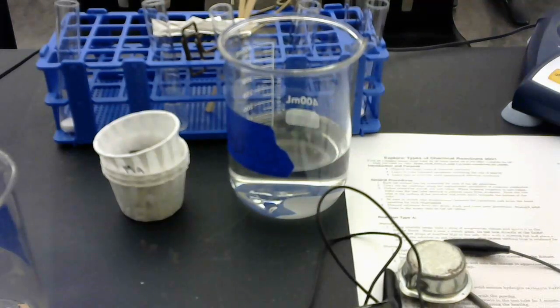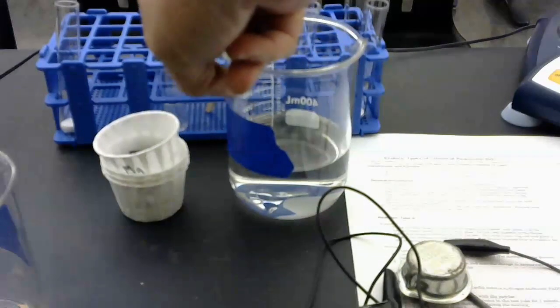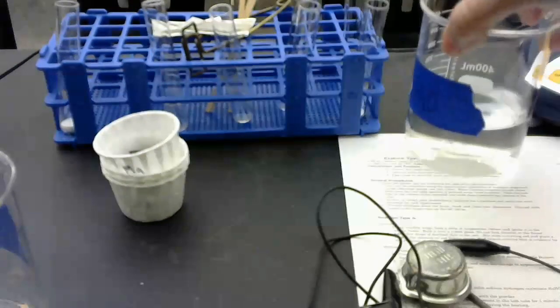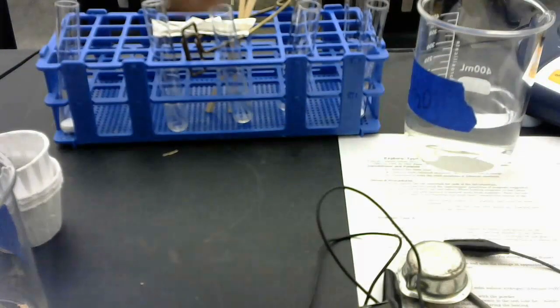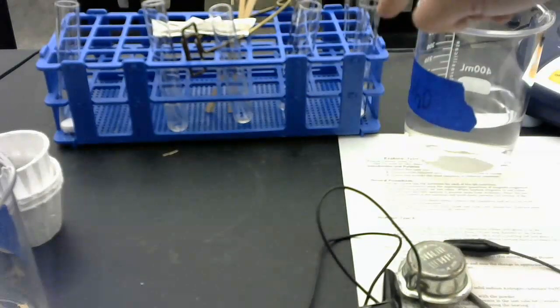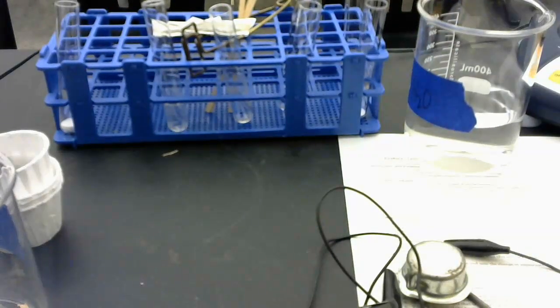So for those of you who are in class, what's going to happen is you're going to show up and you're going to have a lab set up in front of you. At your lab station, you're going to have a test tube rack, this blue thing right here. Your test tube rack is going to have some test tubes in it. You're going to have 1, 2, 3, 4, 5, 6, 7 test tubes. And those test tubes have been labeled with different chemicals.